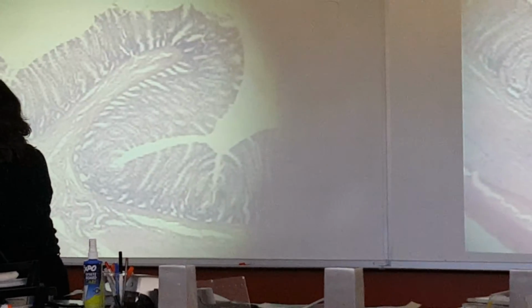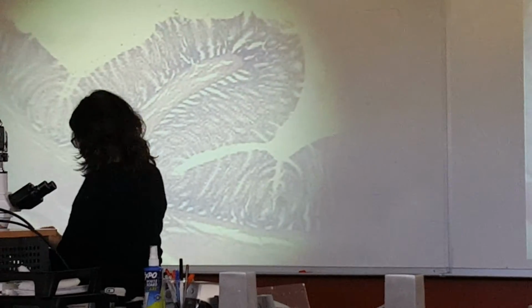I think there may just be one slide left. Just colon. A small section of colon. And we'll focus it up. Put it on the next power so you can see the cells better.